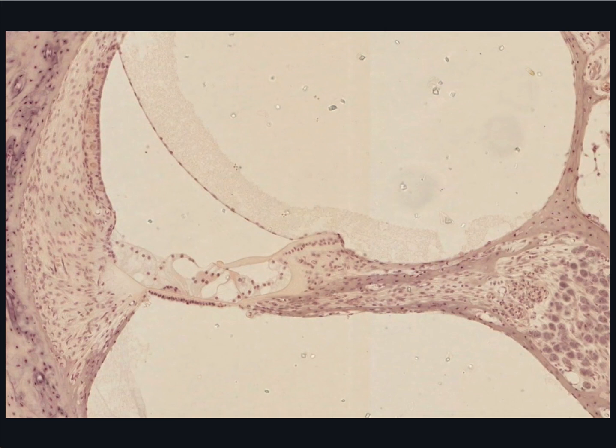The cochlear duct is embedded in reddish or purple stained bone. This coiled duct is sectioned several times to give a set of round profiles through it. You saw this in the previous section. I've selected one turn of the cochlea here.